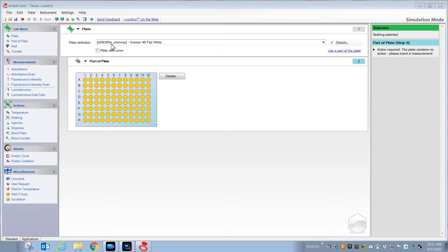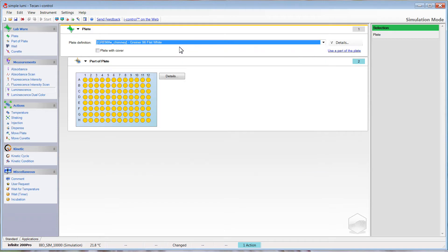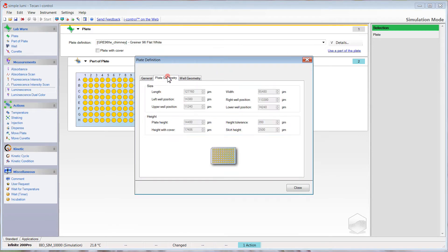For today's example I'm going to use this Greiner flat white chimney plate. If you look through the list of definitions in this pull-down and don't find the plate that you want, then contact TECAN and they'll help you get the right definition. It is very critical that you pick a definition that matches the plate you intend to use, because within the plate definitions are parameters such as the plate height, which is important for making sure the reader measures at the correct height distance so that all the light from a specific well is collected without collecting light from neighboring wells.